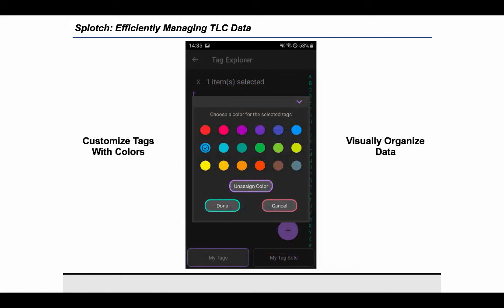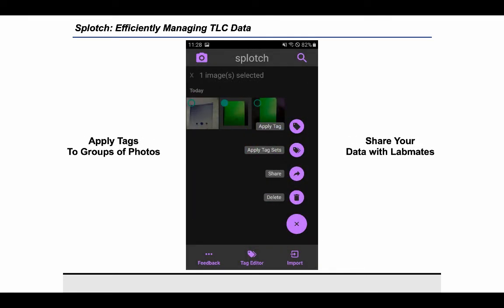You can customize your tags by choosing a color in the tag editor. You can apply tags to groups of photos at a time in the gallery to quickly organize your data. From here, you can also share your data with labmates.